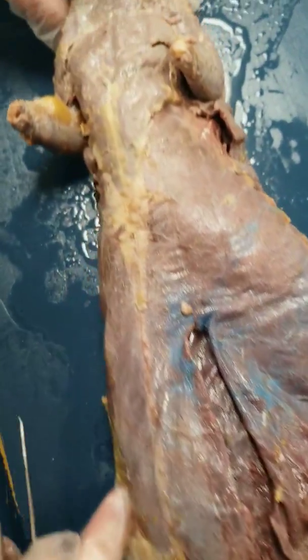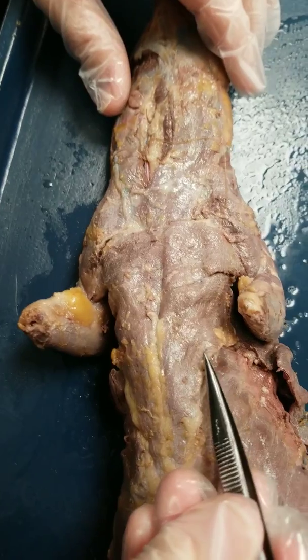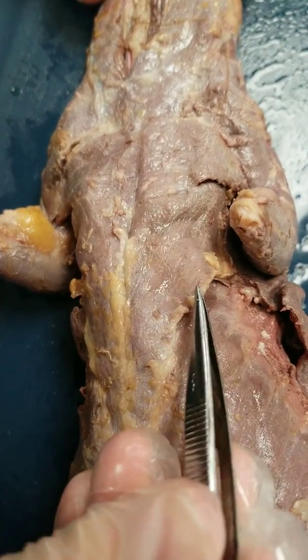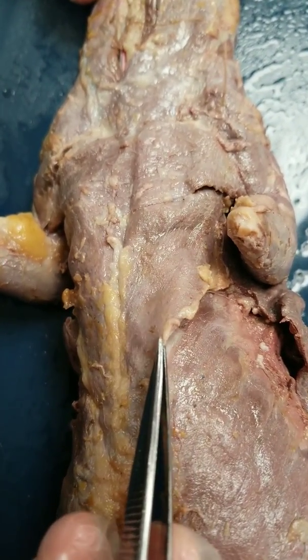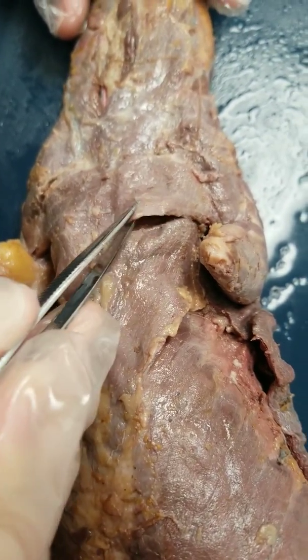Next we're going to move up to the chest. The first muscle you'll see is the pectoralis minor. This muscle is larger than the pectoralis major, which is above it.